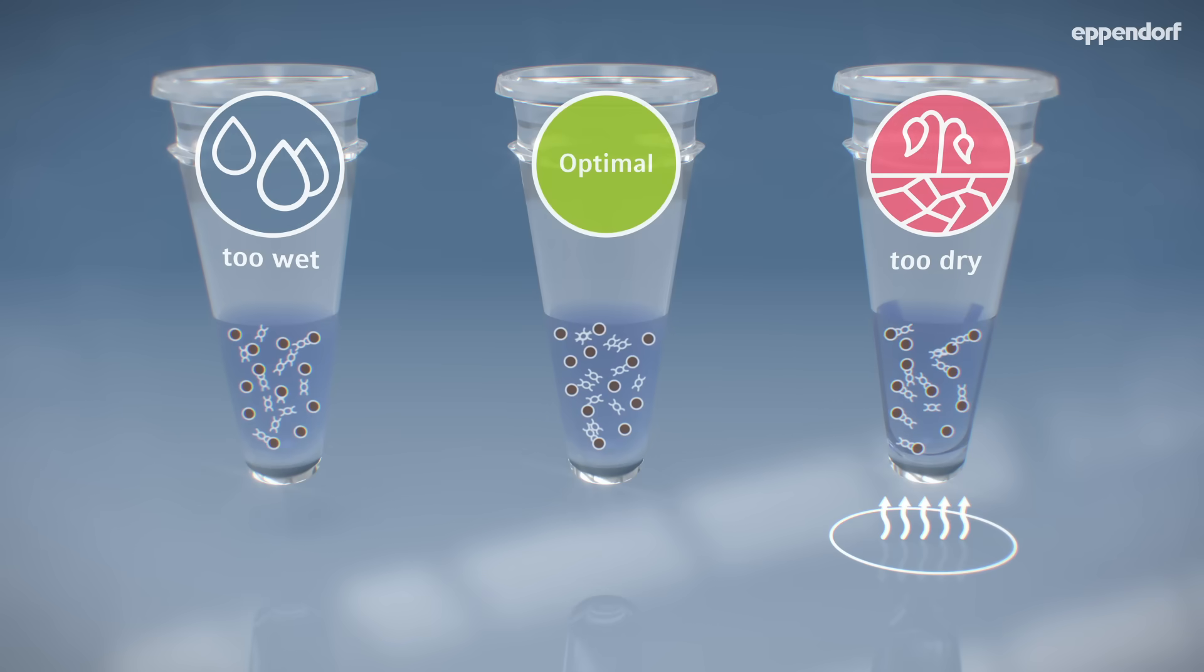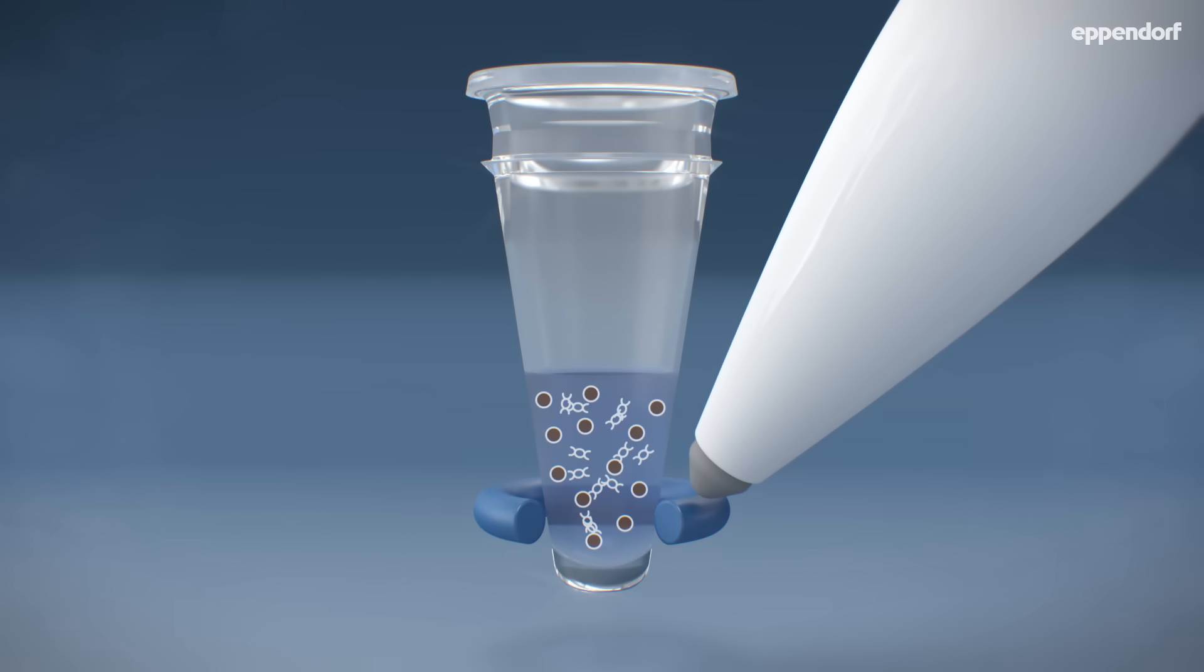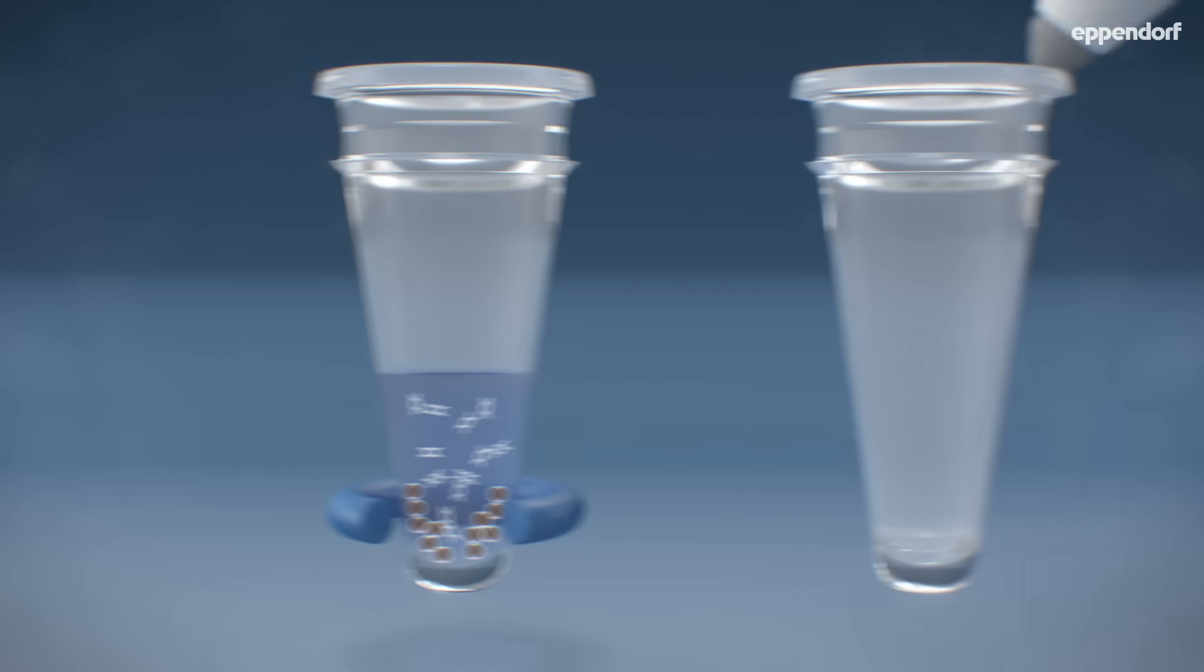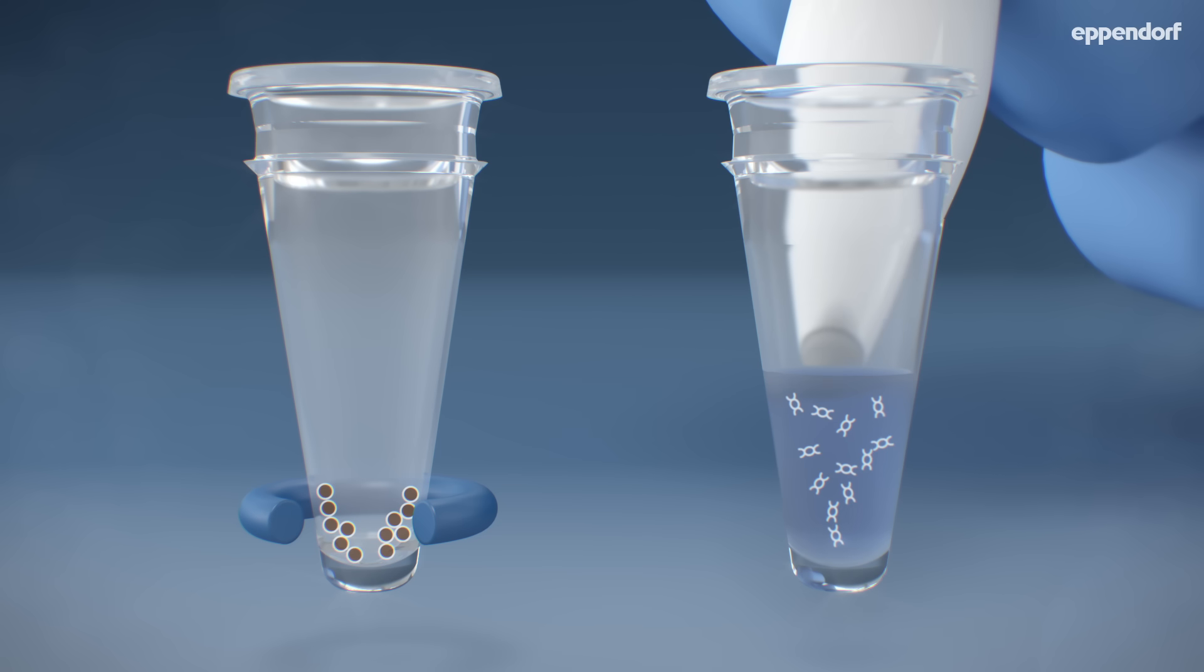In the final step, the DNA is eluted from the beads. The magnetic beads are then pelleted again. The purified DNA sample is transferred to a new well and is ready for the next steps.